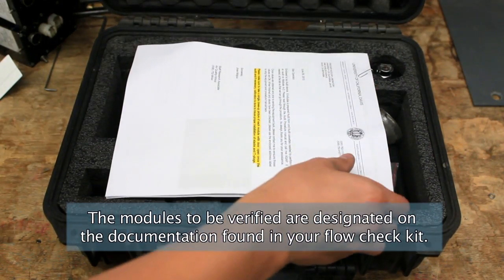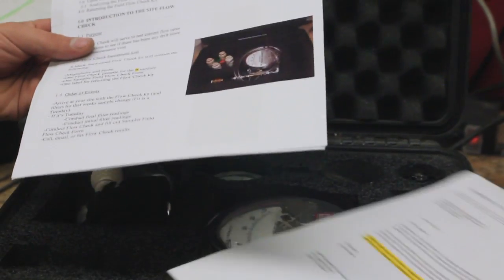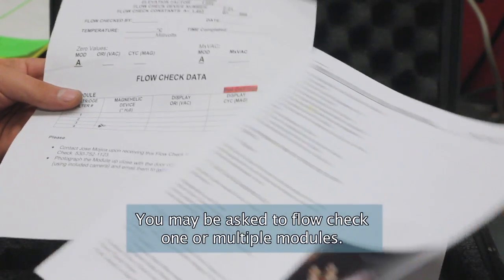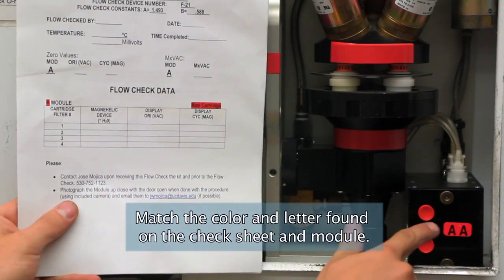The modules to be verified are designated on the documentation found in your flow check kit. You may be asked to flow check one or multiple modules. Match the color and letter found on the check sheet and module.